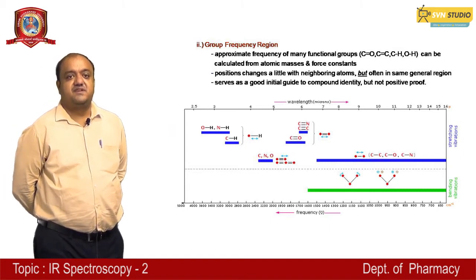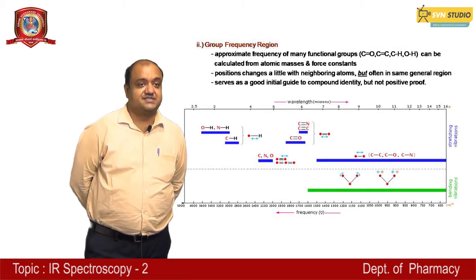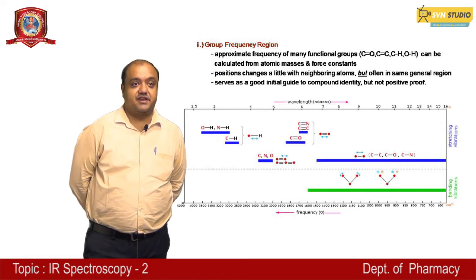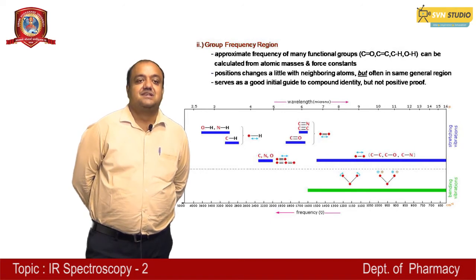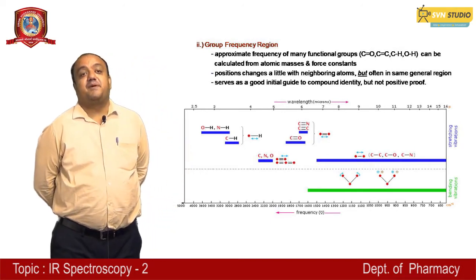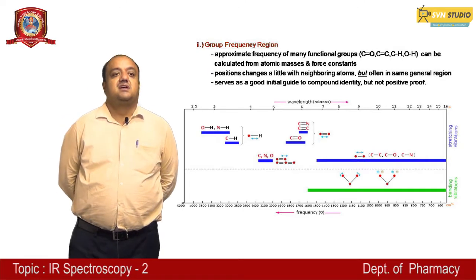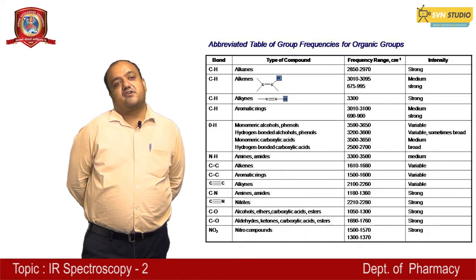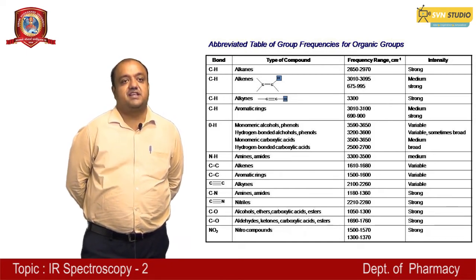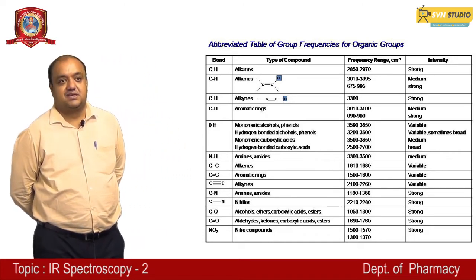The regions show O-H stretching, N-H, C-H and their regions, and carbon-nitrogen and carbon-oxygen, and carbon-carbon single bond, C-O stretching and C-N. This shows the bending vibrations, stretching vibrations and other rotational vibrations that take place. This is a table which describes the group frequencies for organic groups and their bonds, and the frequency which is absorbed and the given intensity.